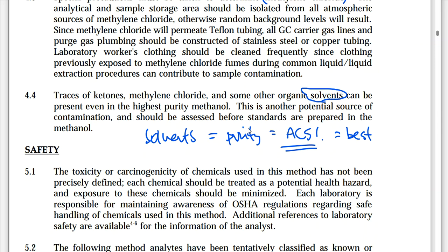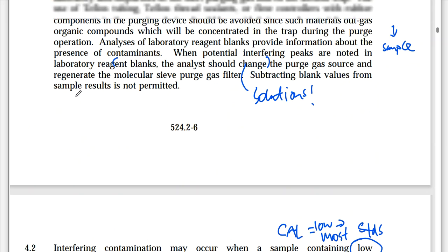Now, there are other grades of reagents that are out there. We've got USP grades, we've got lab grades, we've got reagent grades, we've got biochemical grades. We just have tons of different names that get assigned to the proper type of solvent that we're using, and it's all about purity. That's all that it is. So ACS grade is typically the go-to almost every single time in a lab environment for a chemical or reagent that we order.